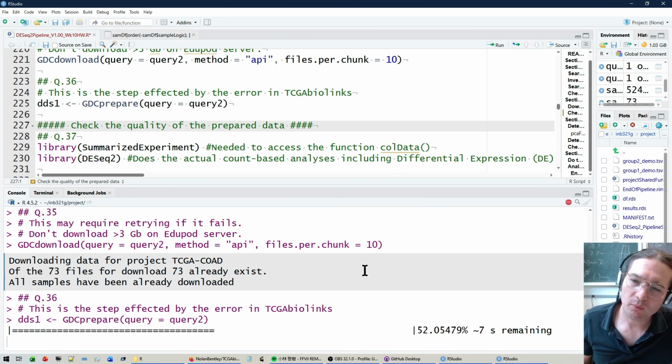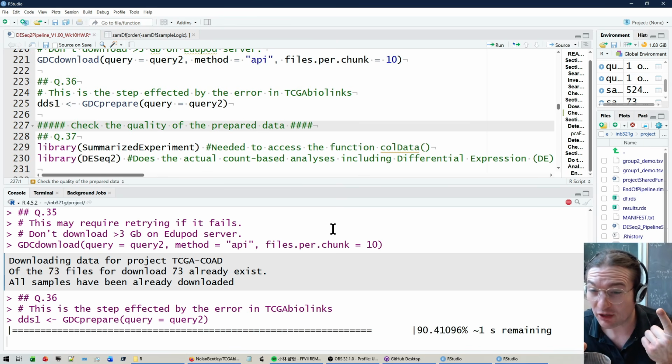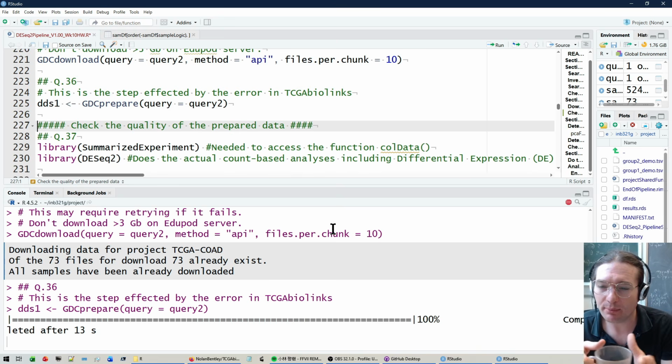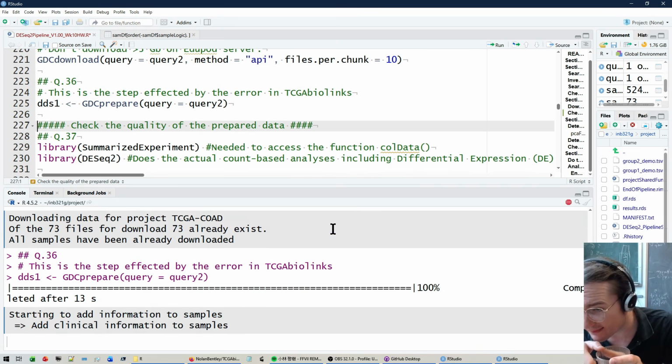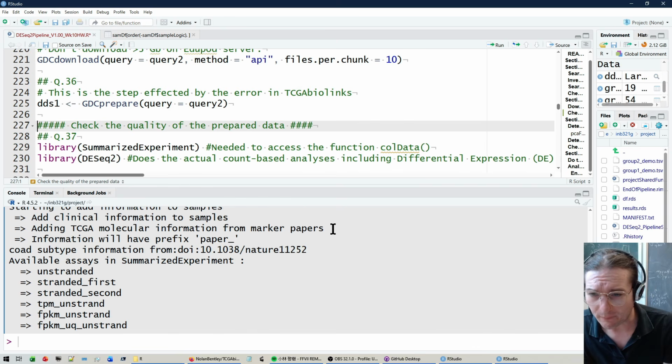Okay, so what this is doing is downloading genomic information, clinical information, and most importantly, the gene expression data. It is then storing all of that in the same object. If that sounds complicated, it is, and you were right, it should sound complicated. It requires a multi-dimensional array.